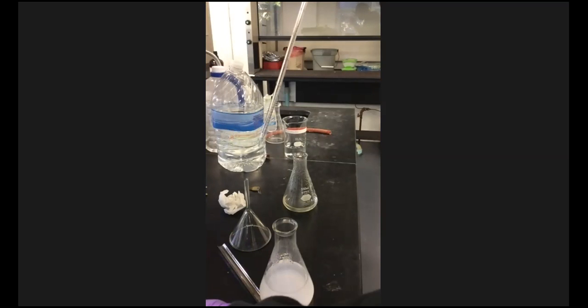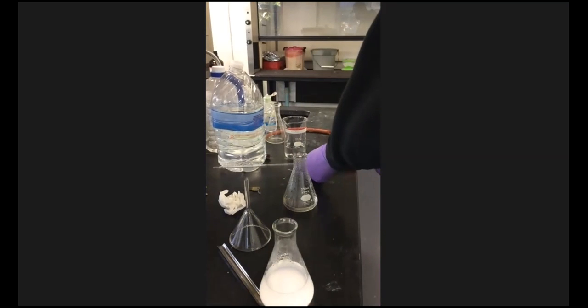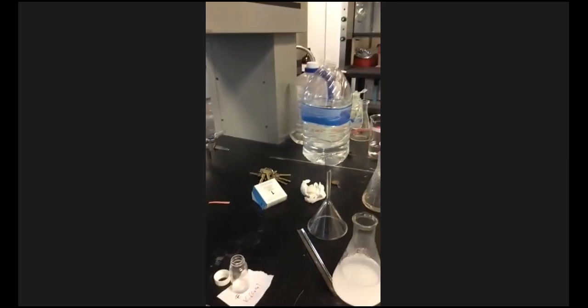All right. So what we're looking for now, this is the big deal of the whole lab. If we add calcium chloride to this solution and we see more precipitate, then that means calcium chloride is limiting. If we add potassium oxalate to the solution and we see more precipitate, that means potassium oxalate was limiting.